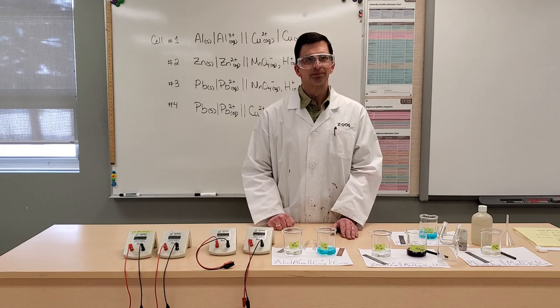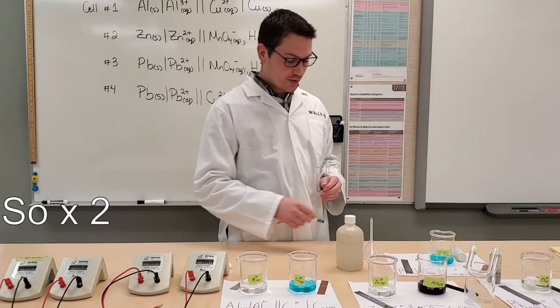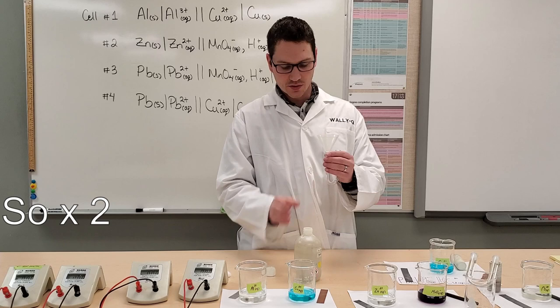Howdy, it's Wally G here. So we're going to construct our first cell, and the first cell is going to use a salt bridge. So this salt bridge, or the U-tube, is going to contain some sodium nitrate. And the way we do that is we're just going to take our U-tube, we're going to add some sodium nitrate.